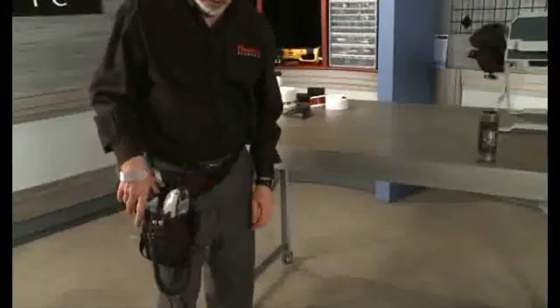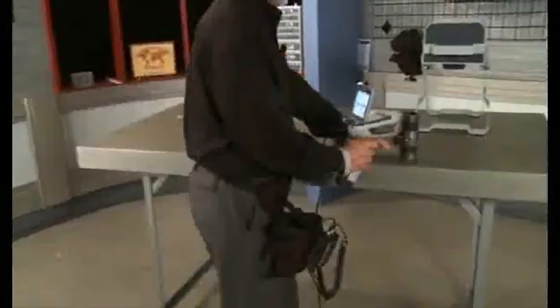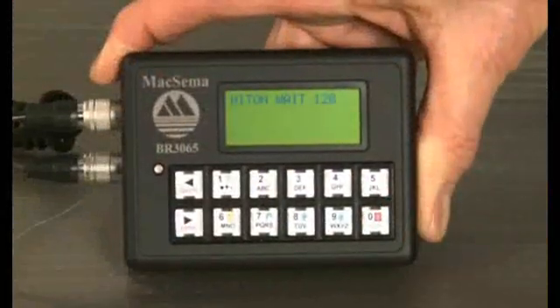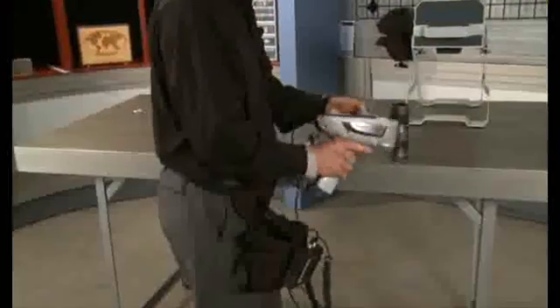For one-hand operation, it is recommended that you clip the button reader handheld onto the analyzer holster. You can easily press the gauge key to capture the analyzer data. Normally, you don't need to look at the display. Hearing the beep should be sufficient. Once you hear the beep, you are ready to write data to the button.